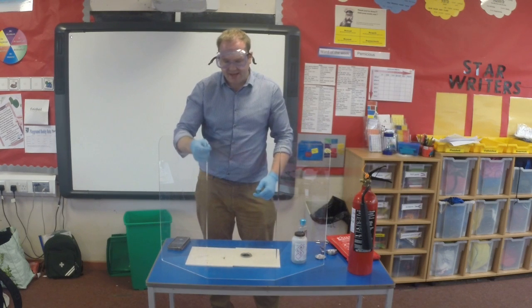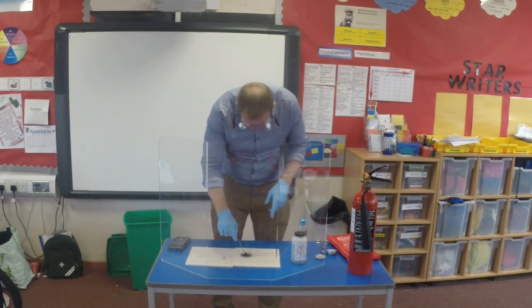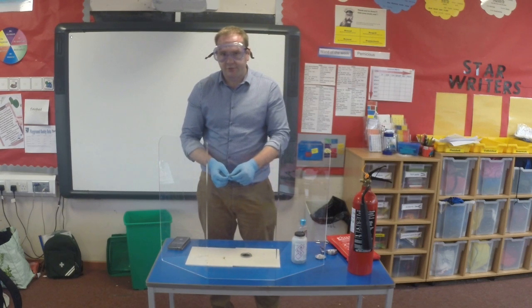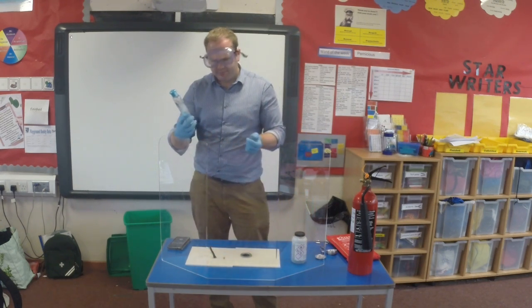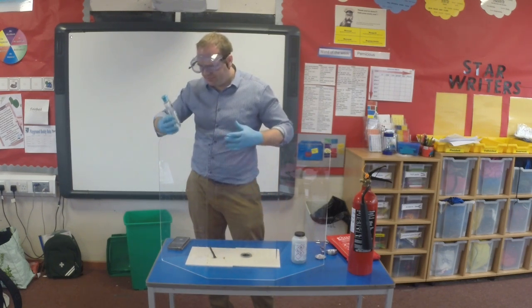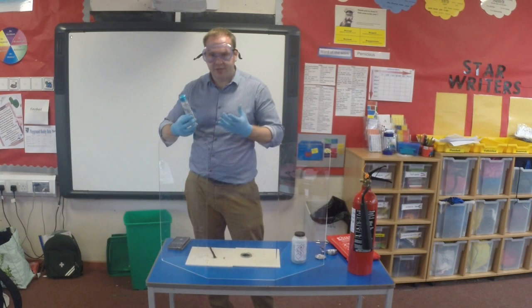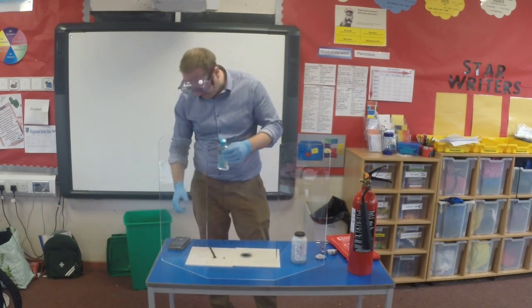Now, once I've set this out using the spatula, I'm going to create a small depression in the middle, so it's almost like I've got a miniature volcano. I'm just going to create a hole in the middle here, and that is where I'm going to put the glycerol. Now the glycerol or glycerin, same thing, that's really where the source of the chemical energy is. That's basically what we're oxidizing, what we're igniting, what we're setting fire to.